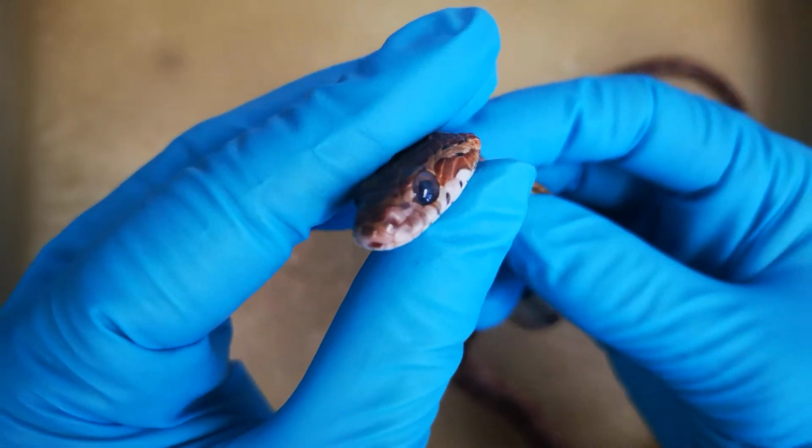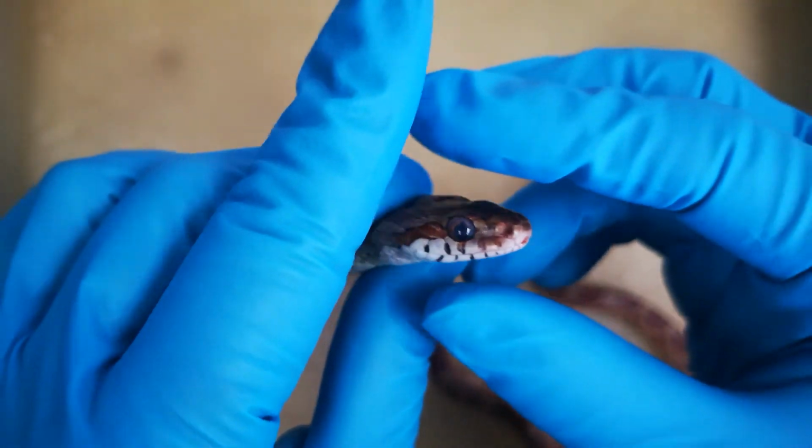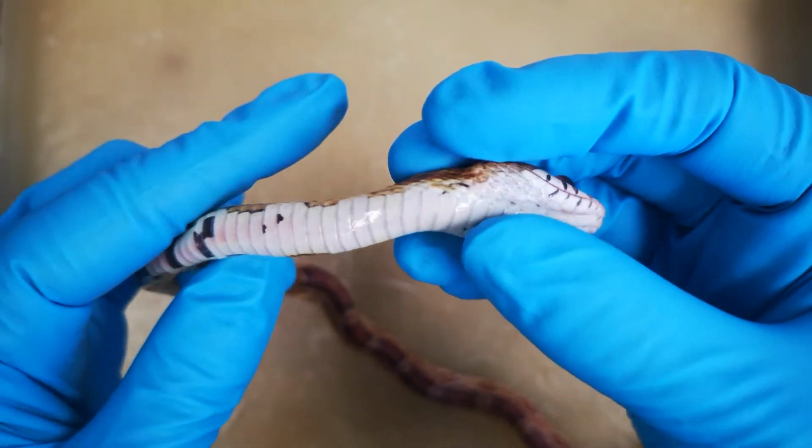In anterior view, a small notch is visible in the rostral scale of the snake. It is through this notch that the snakes pass their tongues for olfaction.